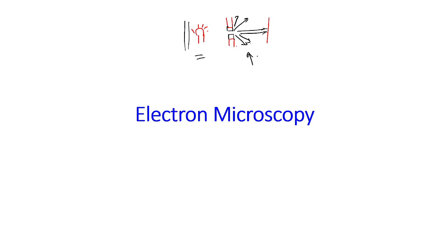Now, there is a relation between diffraction and wavelength. Higher the wavelength, higher is the diffraction.